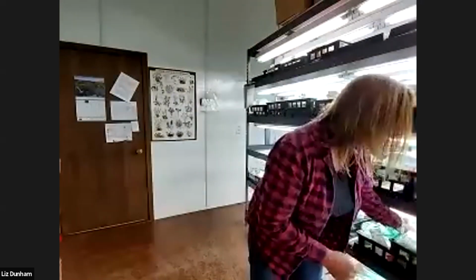The other reason that people will come to a tissue culture lab is because there is no other way to propagate that plant. They're not successful from cutting, they don't do well with grafting, seeds are not easy as well, so we'll do them in the tissue culture lab. It's an environment that many plants will respond to, and they will multiply at a hopefully consistent rate after we do a little bit of manipulation on them.